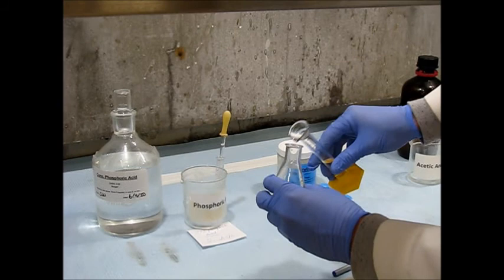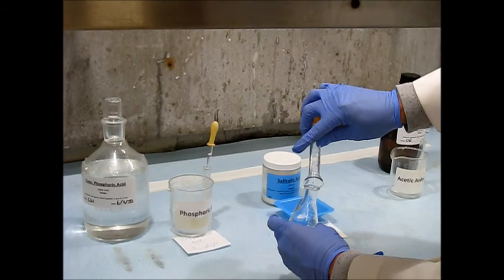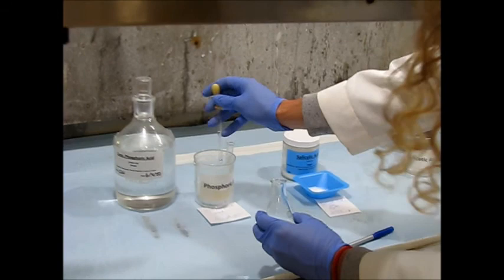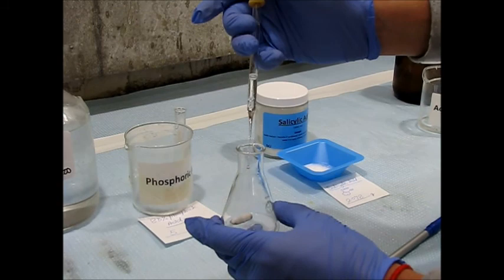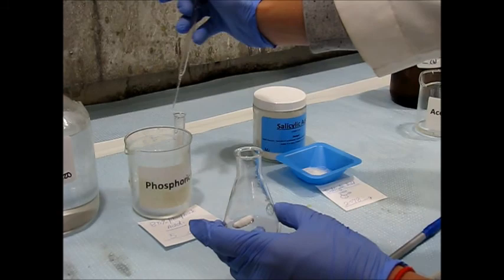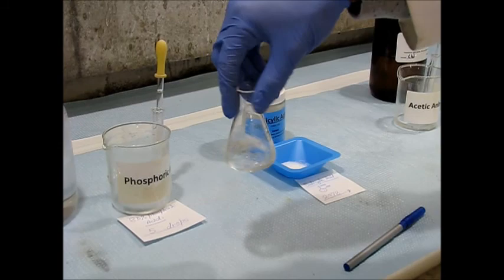So this is our acetic anhydride. And we'll add five drops of our phosphoric acid. Go ahead and swirl it up so it starts mixing.